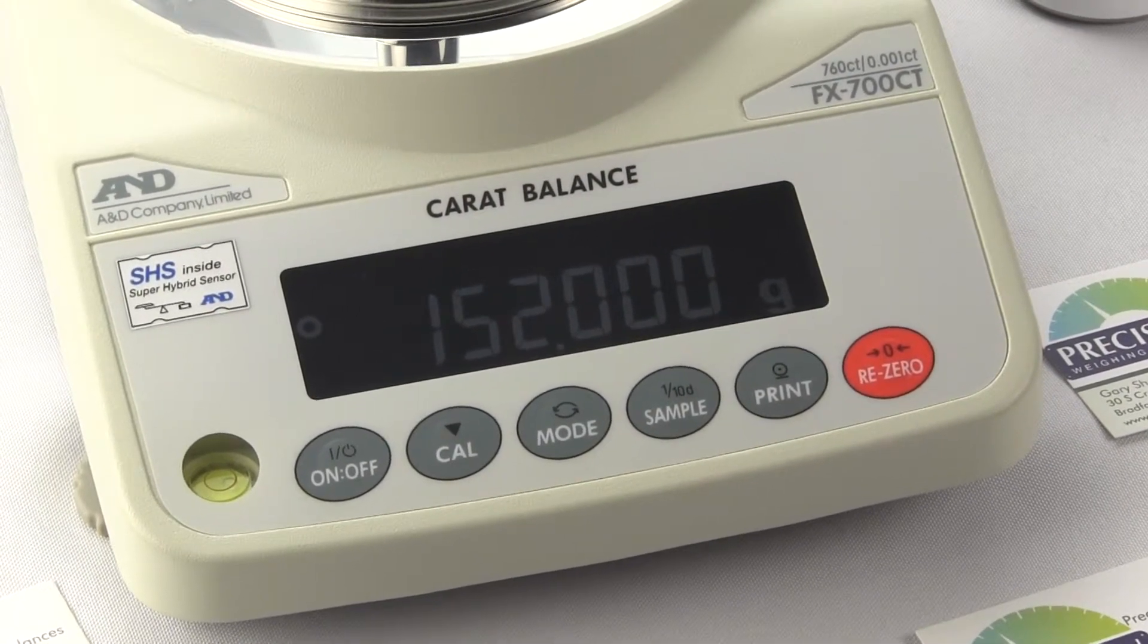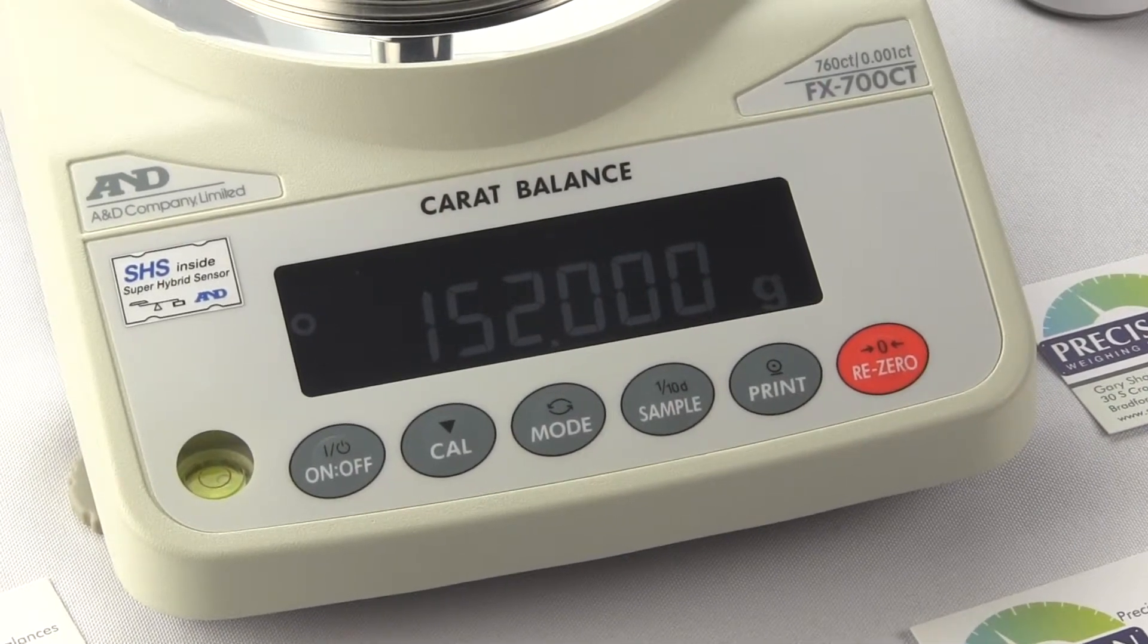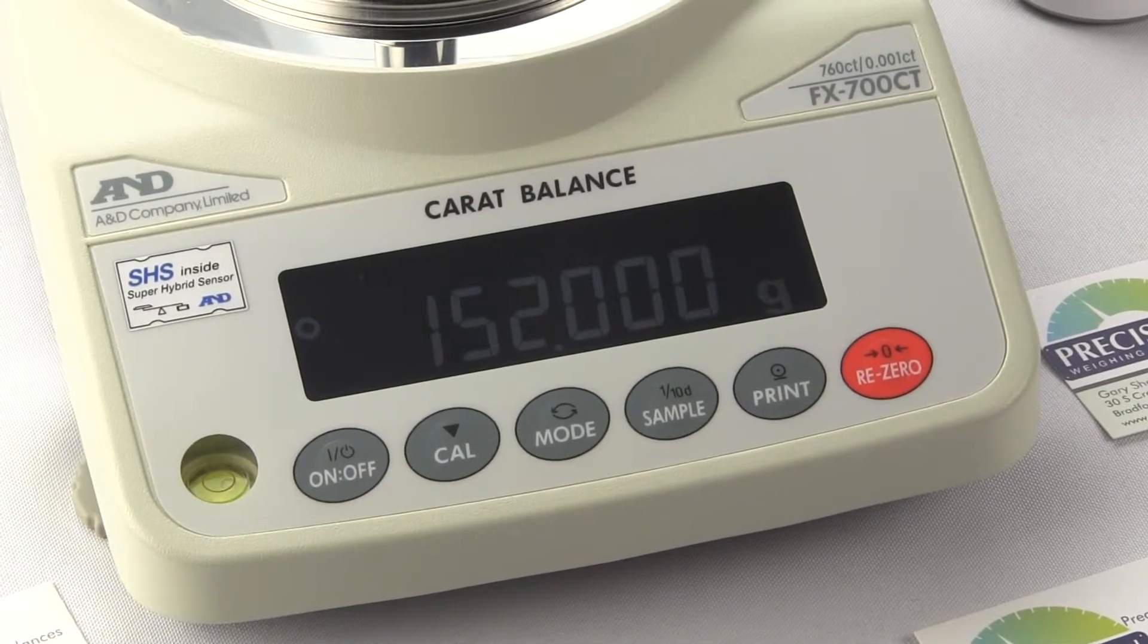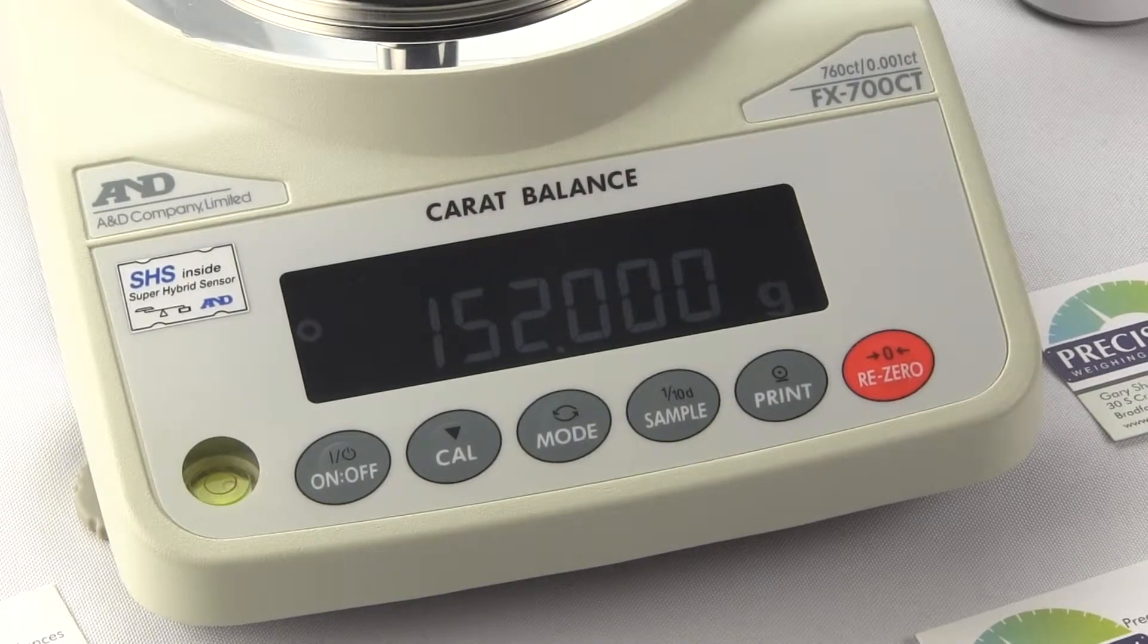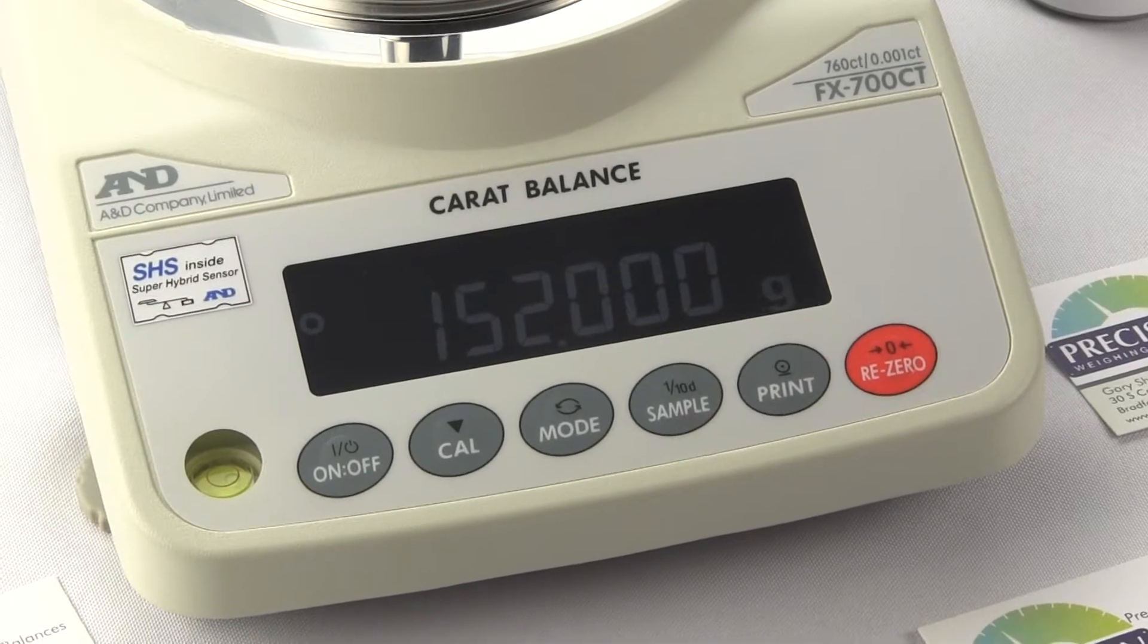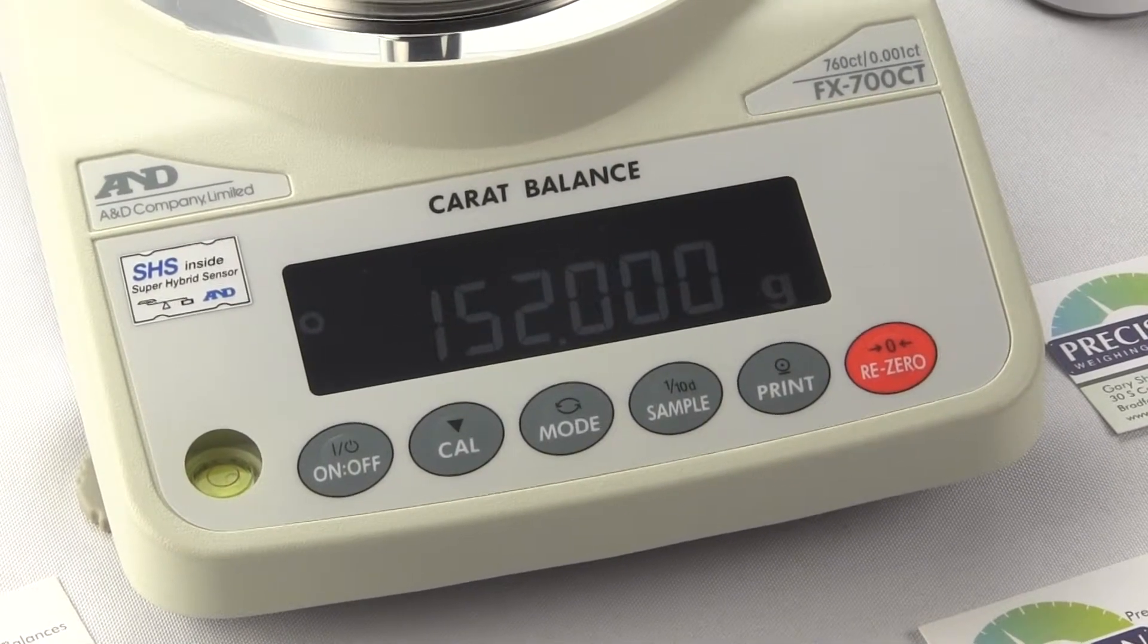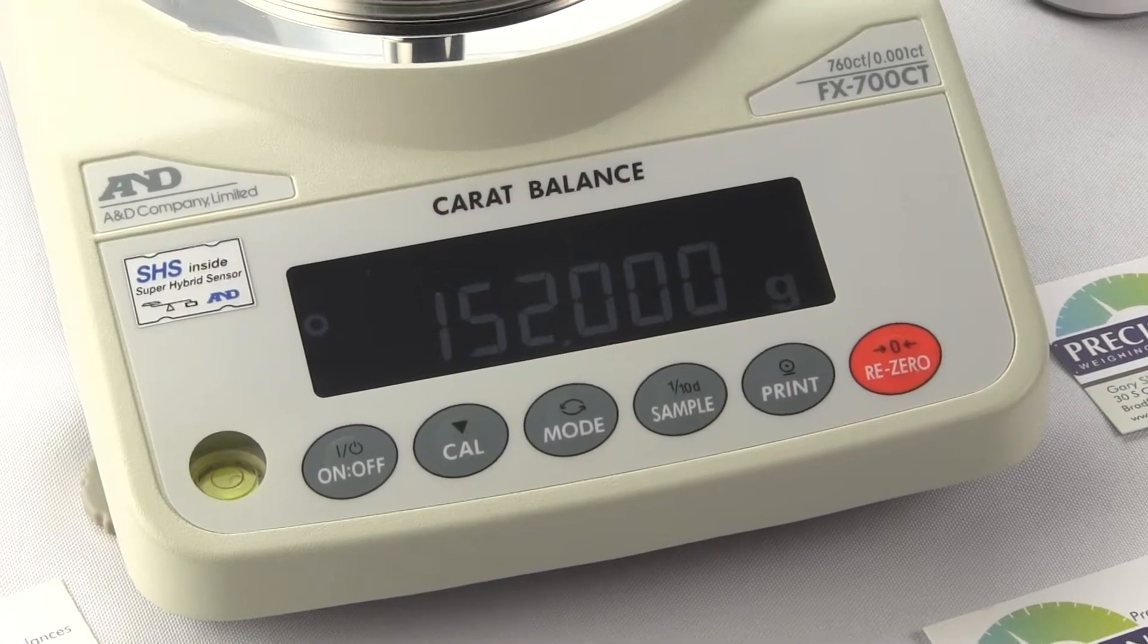Pistol and air rifle loaders can accurately weigh casings, bullets, powder to control the extreme spread and velocity compared to off-the-shelf ammo level reloading. With low cost strain gauges like the GEMPRO 250 or ACULAB VIC123 the numbers drift and we get a lot of complaints, people looking to upgrade their balance.